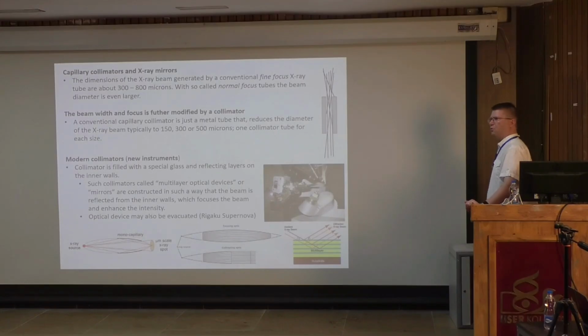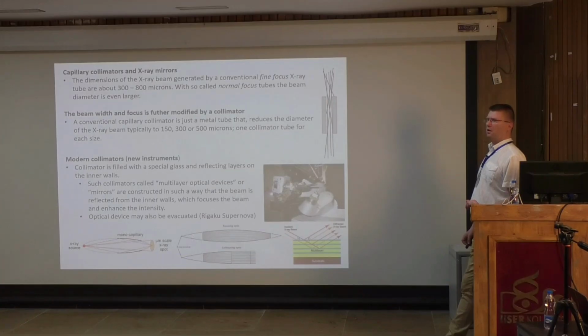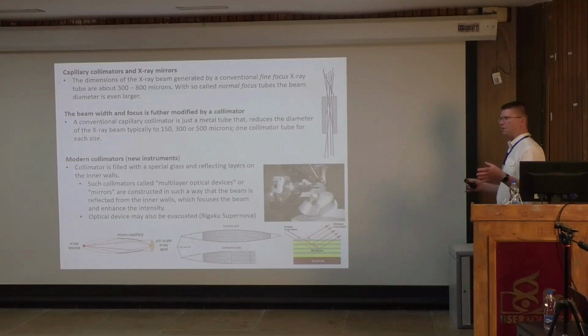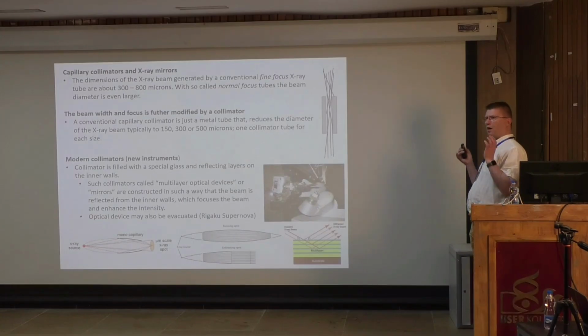Like what we have, both new instruments, even this 13 or 14-year-old instrument, already has this collimator type of thing. And now there are even additional new features of these. You can even modulate, you can split the beam. We can also do additional modulations on the radiation, on the electronics or the optics. And this is the actual cartoon for these kinds of things. And these are all helpful for having a coherent, pure X-ray beam. And this is actually what we need.